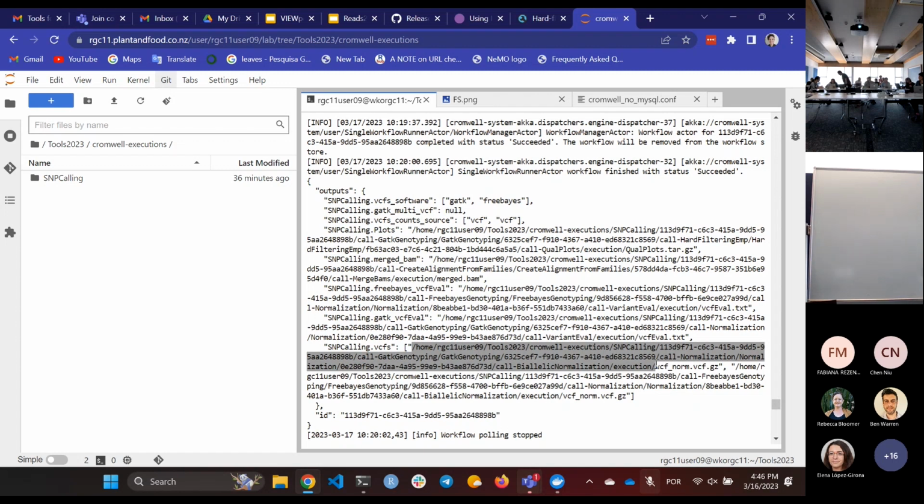She found it. Normalization. You need to be in your log.